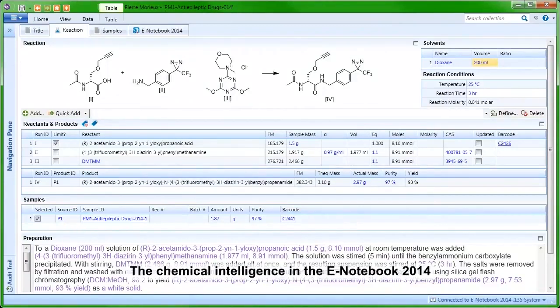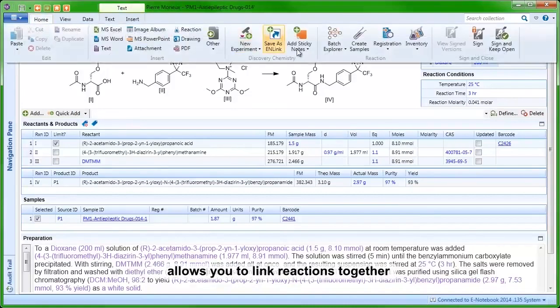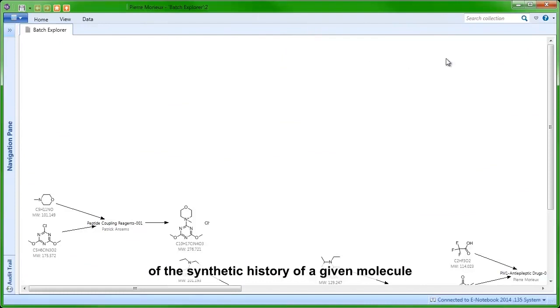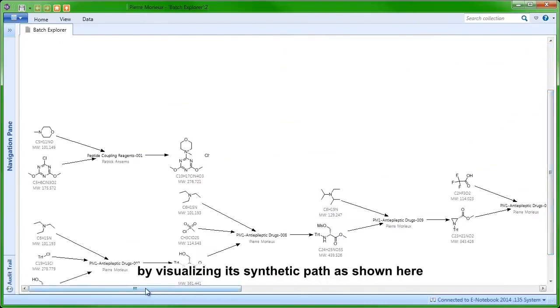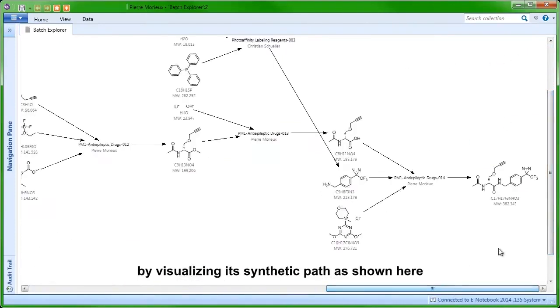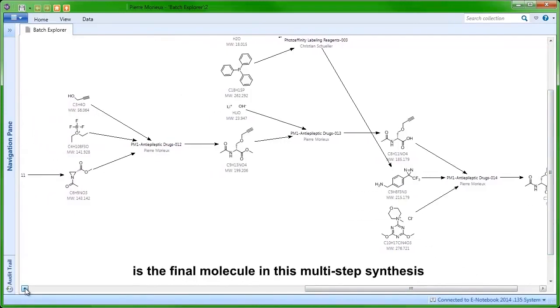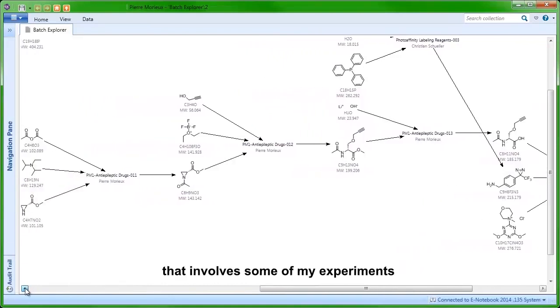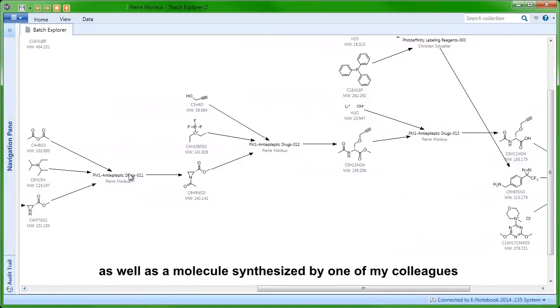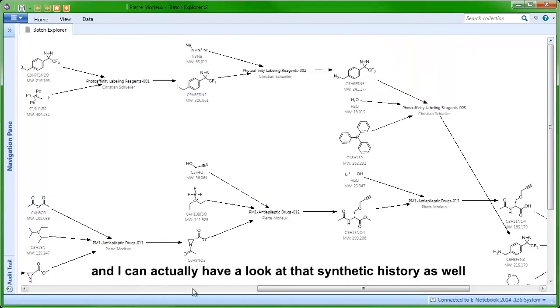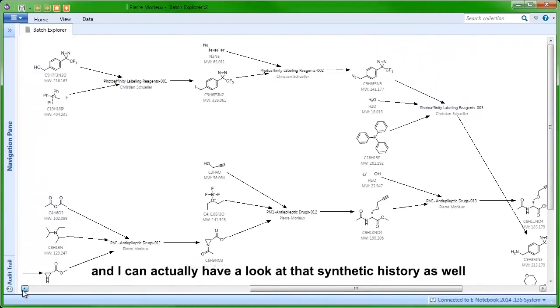The chemical intelligence in the Notebook allows you to link reactions together, which means that you can have an overview of the synthetic history of a given molecule by visualizing its synthetic path. Here you can see that the molecule we were looking at is the final molecule in a multi-step synthesis that involves some of my experiments as well as a molecule synthesized by one of my colleagues.